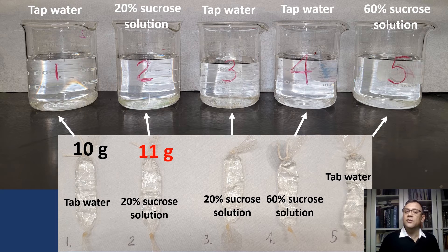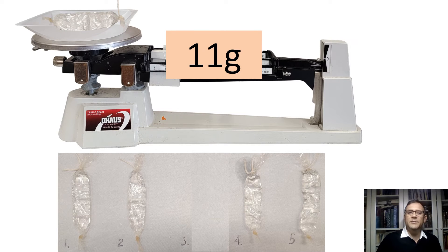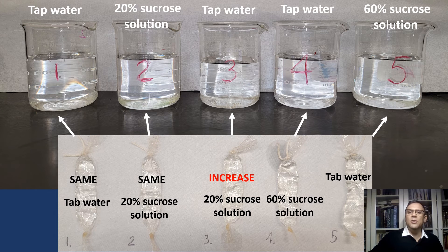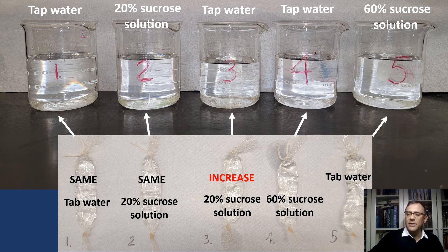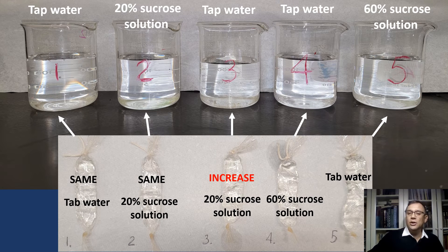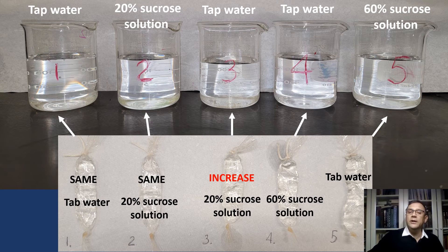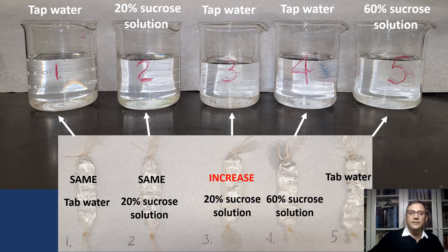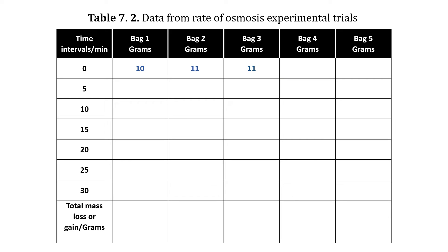Now it's time to measure the mass of bag three. Here it is. Bag three also has a mass of 11 grams, the same as bag two. Now let me point out a common mistake. While measuring, I found myself trying to interpret the results. This approach is not ideal. At this stage, we should focus solely on accurately recording the data, acting as objective observers. All interpretations and analysis should be saved for the end of the experiment to avoid bias. It is essential to conduct the experiment without drawing conclusions until we have all the data. Let's record our data: 11 grams.